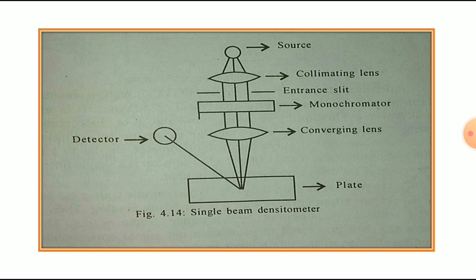So this is the schematic diagram of the single beam densitometer. In the next lecture, we are going to learn the double beam densitometer. So thank you, dear students.